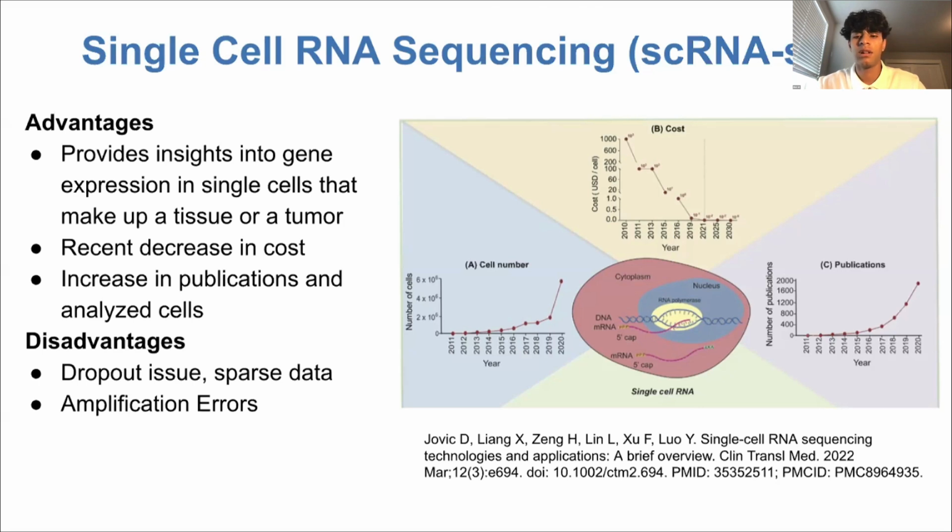There's many single-cell RNA-seq workflows out there right now, but scRNA-seq2Targets is unique because it focuses on identifying targets and drugs that may be used to manipulate the composition of the profile tissue.